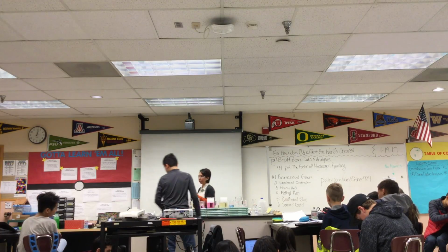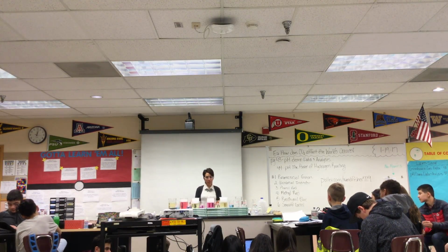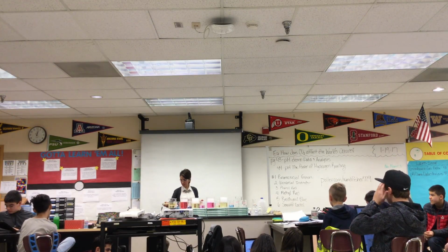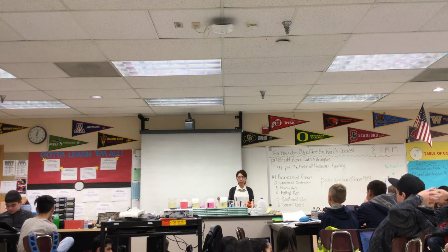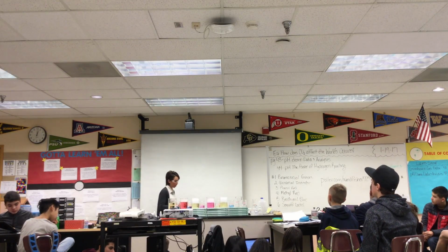Thank you. You were a great pH helper. Based on every single one of the beakers, what happened to the pH? It went down, right? It became more acidic when we added in carbon dioxide.